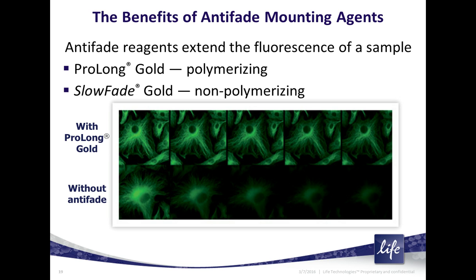One person asked if Triton X should be used between blocking, primary, and secondary incubation steps. Generally, I recommend including the detergent in with all washes and incubations, especially with tissue. Now, with cells, you can get away with just doing the permeabilization at the beginning for the most part.